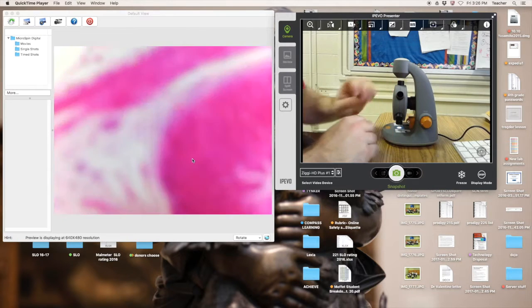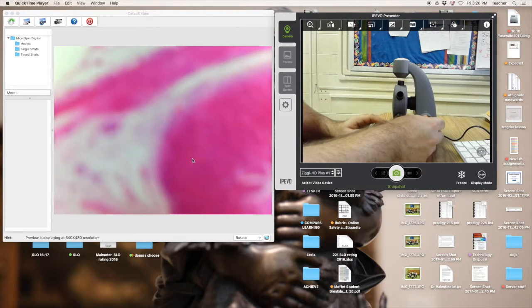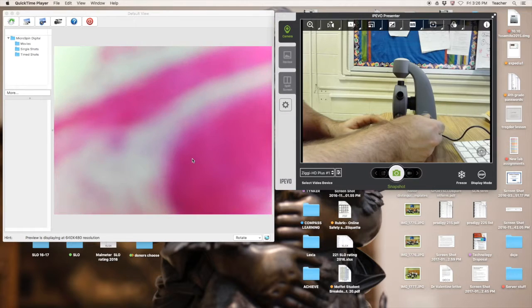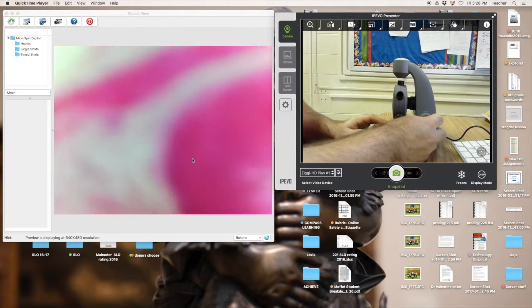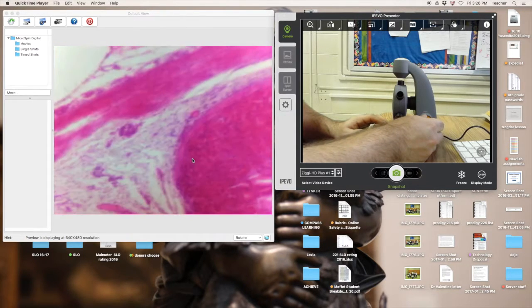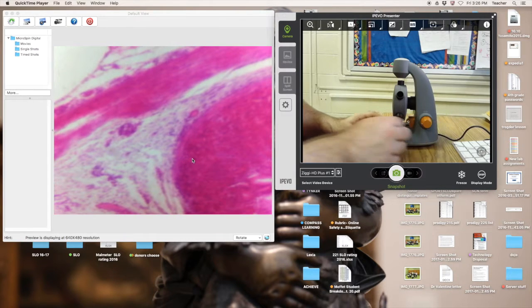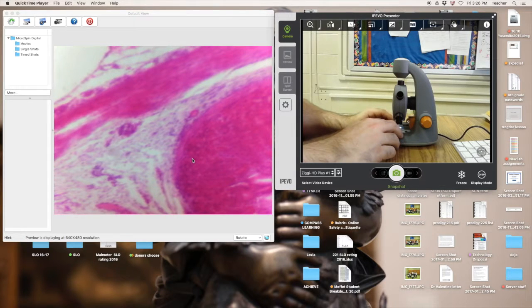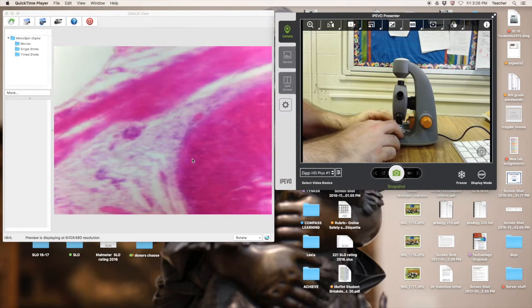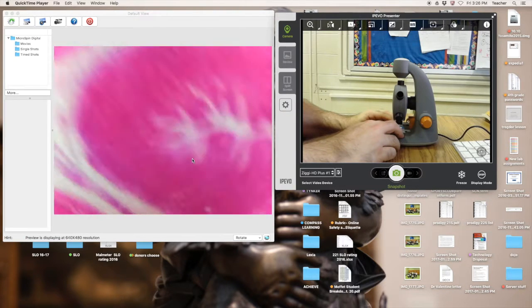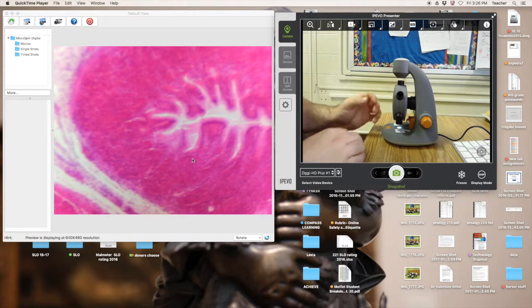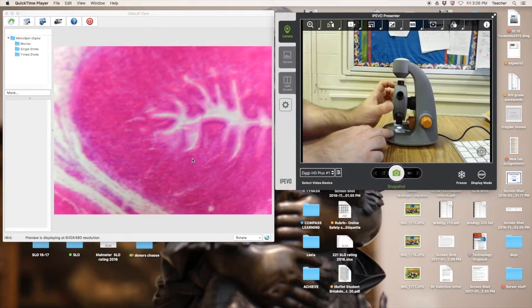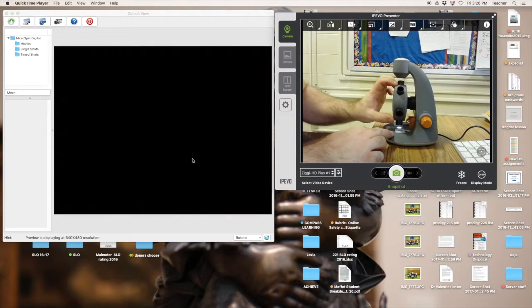50 times zoom. Really see some of the finer details now, and you can physically adjust the slide if need be, being careful and moving very slowly. Now I can zoom one more time to our 60 times zoom and full zoom on this model microscope.